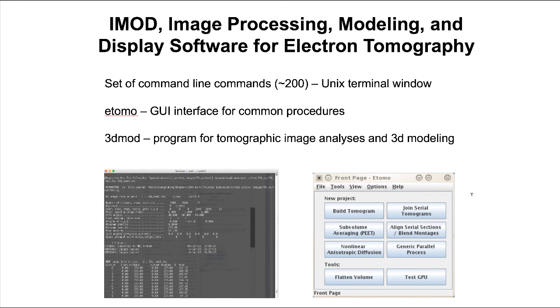So far I've explained the basics about electron tomography. From this I will talk about more of a practical aspect of electron tomography. To do electron tomography, we use a software package called IMOD.